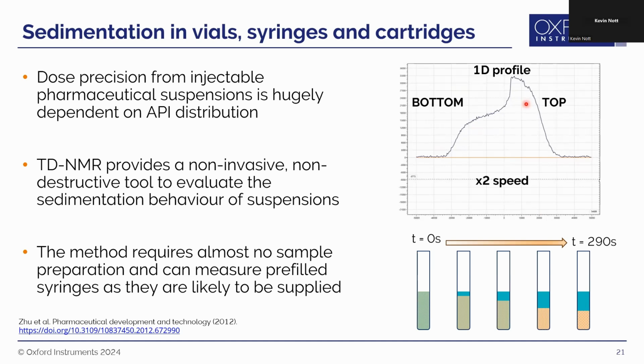So Zhu and co. monitored sedimentation of model samples in syringes, non-invasively, non-destructively, as they were stored at 2 different temperatures over a period of a few months. And then subsequently, they investigated resuspendability.